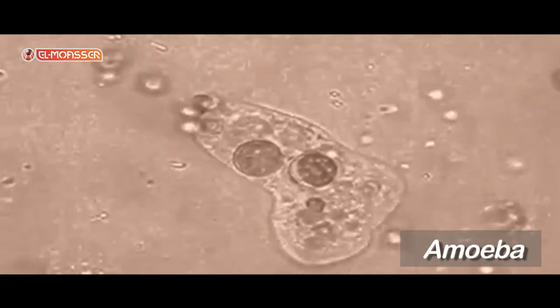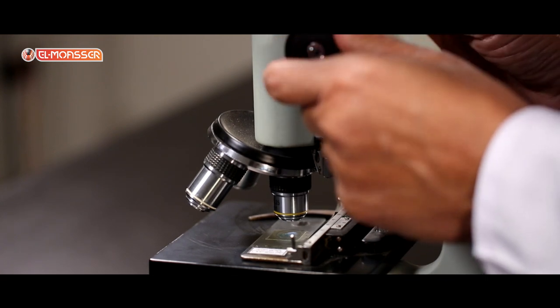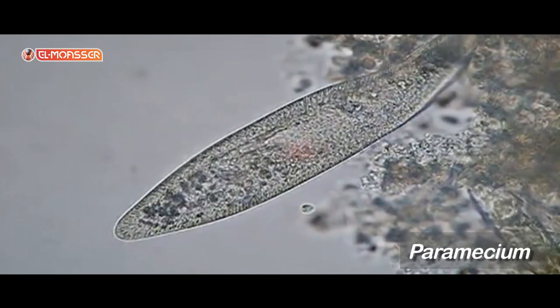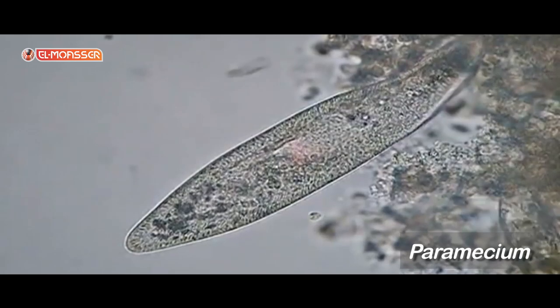Paramecium moves by cilia which surround its body.